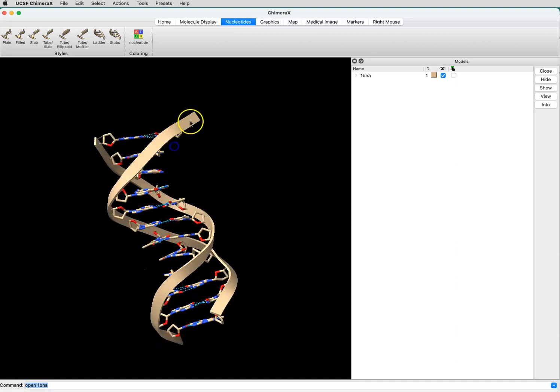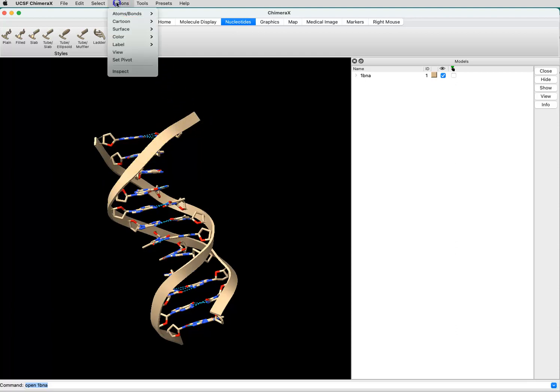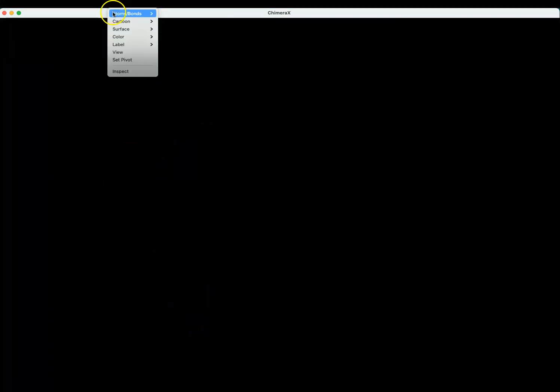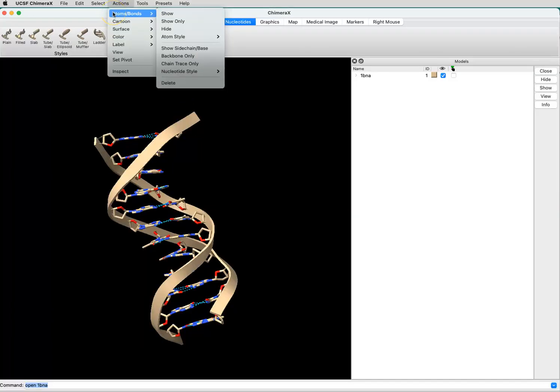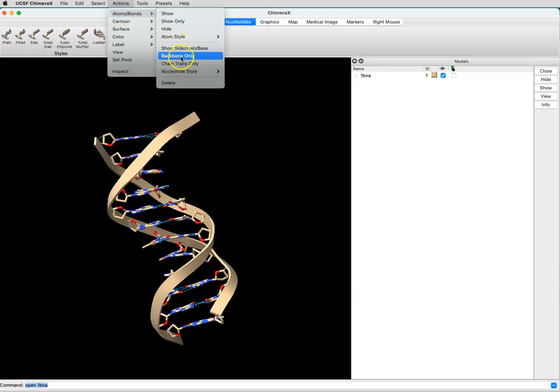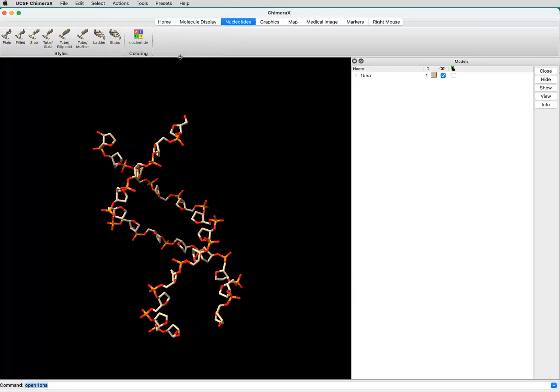If you want to show the backbone atoms, you would go up to the Actions menu, select Atoms and Bonds, and then you'd say Backbone Only, and that shows the backbone atoms.